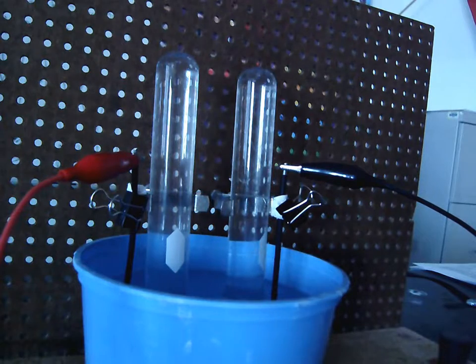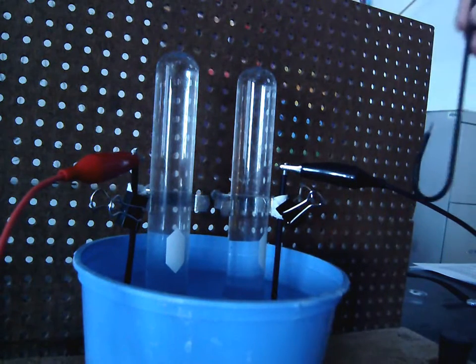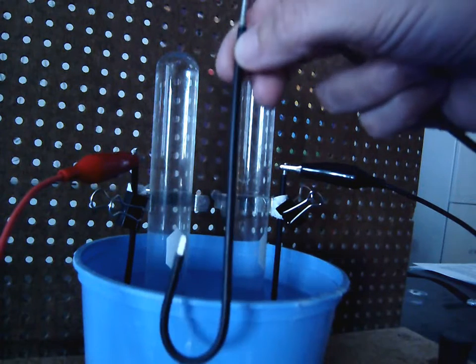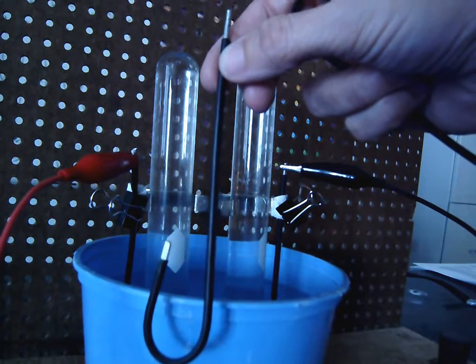This is just a regular electrode. Let's see if I can hold this back here for you to see a little bit better. Or maybe not. Maybe it's better here. Okay, there you go. So there's an electrode.